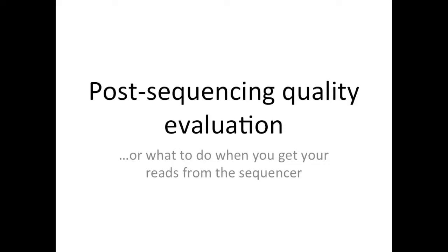So you just got your data back from the sequencer, and you have this really big FastQ file, and you're wondering, what do I do now? Well, I suggest that the first thing you do is look at your post-sequencing quality and make sure that your libraries look how you expect them to.